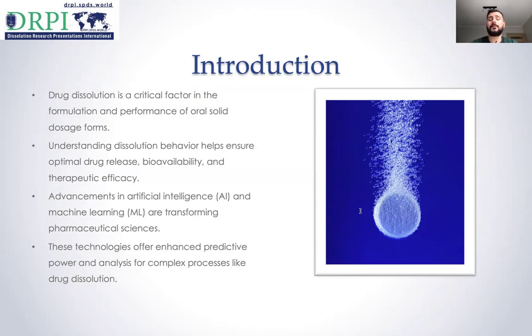However, traditional dissolution testing is essential for quality control, but it offers limited insight into the dynamic events that occur during the dissolution process, such as gel-forming layer or erosion. Recent advancements in machine learning and artificial intelligence have opened new possibilities in pharmaceutical science.